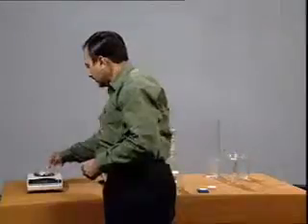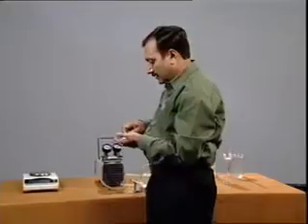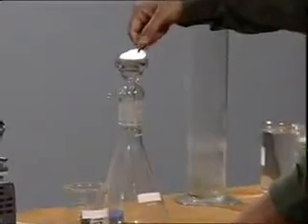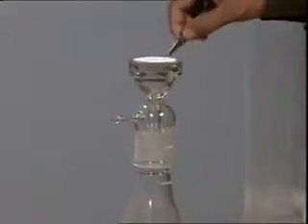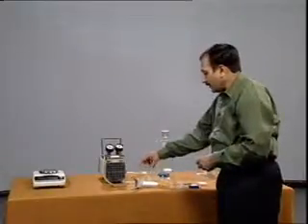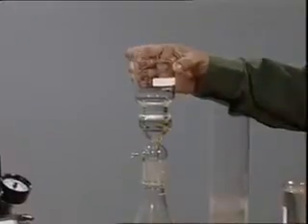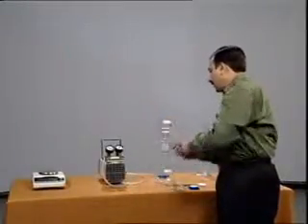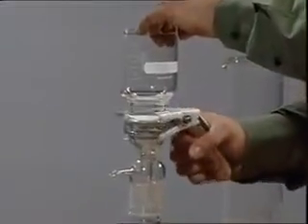Now, take the filter and seat it on the filter base. Now, place the funnel at the top and hold them together using the spring clamp.